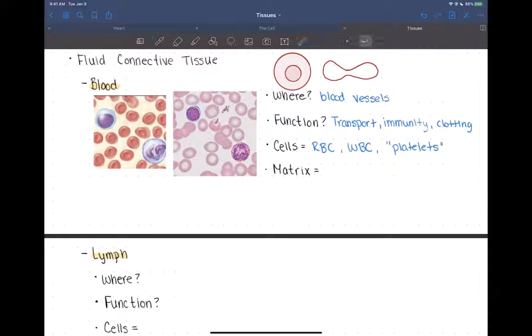It's very, very thin in the middle, which is why it looks almost white there. So there's no hole in it like a donut, but the two pieces of plasma membrane are so close together that it looks almost like there's a hole. That's how you can recognize a red blood cell. They don't have a nucleus. So these would be red blood cells all over here.